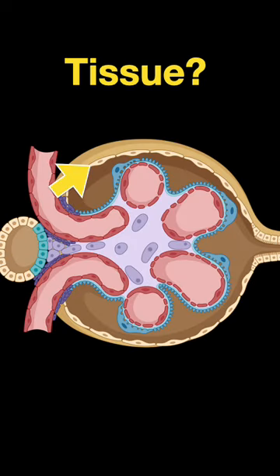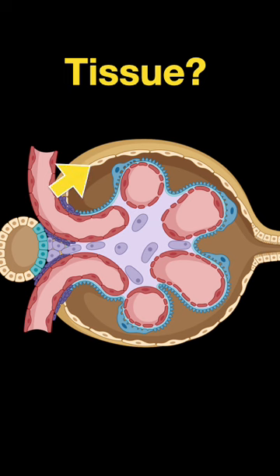What tissue is shown here? That's simple squamous epithelium.